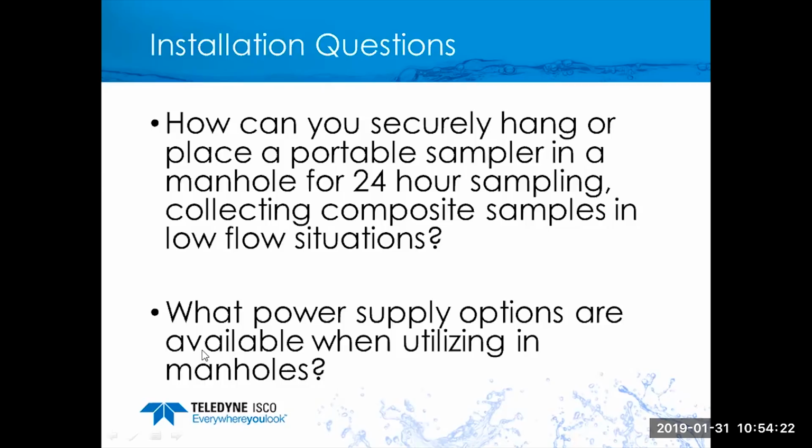For short-term needs, where we're sampling on a regular basis, NiCad batteries are probably going to be a better option for you in that you'll get more charge-discharge cycles out of a NiCad over its life. Additionally, it charges more quickly than a lead-acid battery does. And it also is less prone to the effects of cold temperatures.